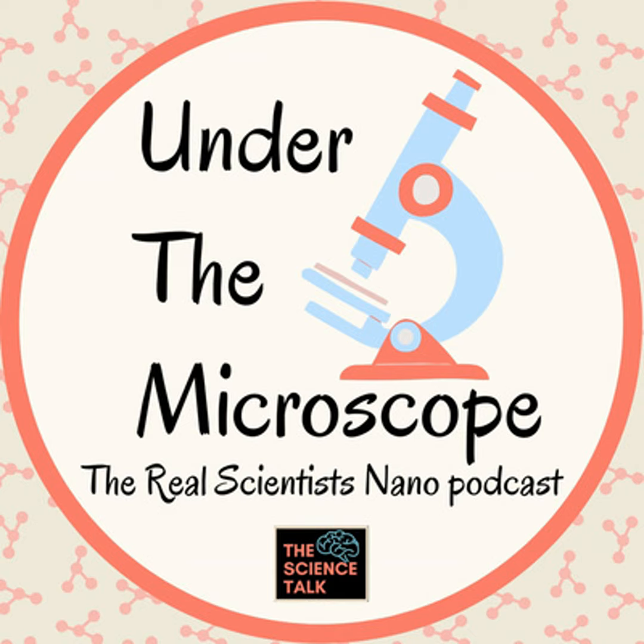For example, one of my favorites are gold nanowires, because we've been using the AFM tip to manipulate gold nanowires and to move them and assemble them to make nanoelectrodes. That was quite fun to play around with, and to see that we could cold weld them and make nanoelectrodes in a controlled way.